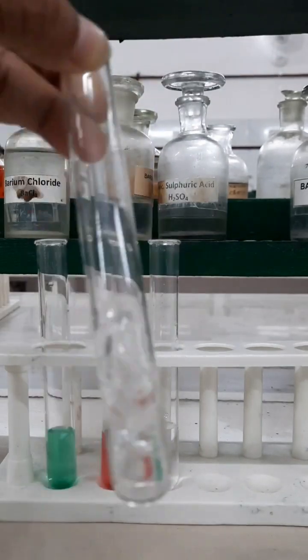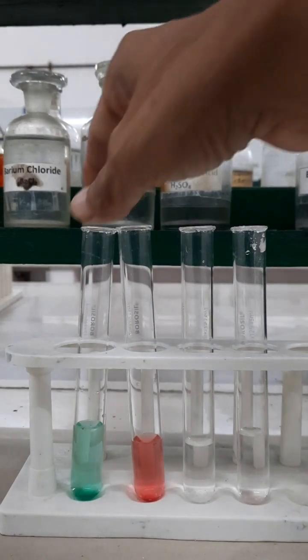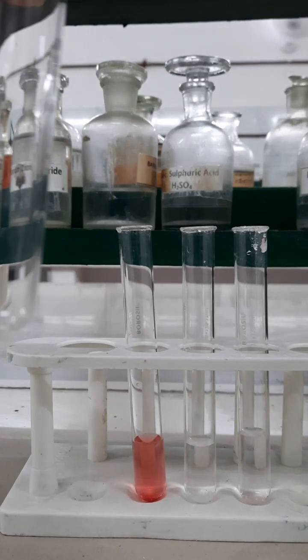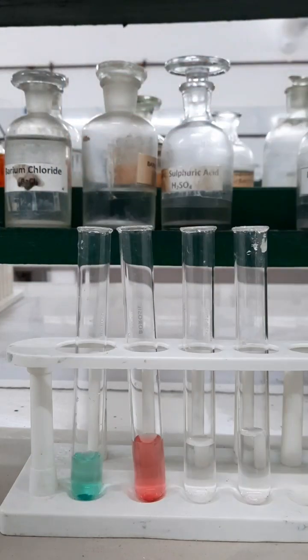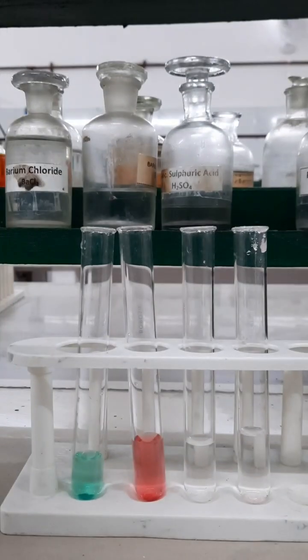Now let us perform the sodium hydroxide test in the respective salt solutions. First of all, I am taking approximately 1 ml of nickel sulfate solution and I am adding sodium hydroxide solution into it.